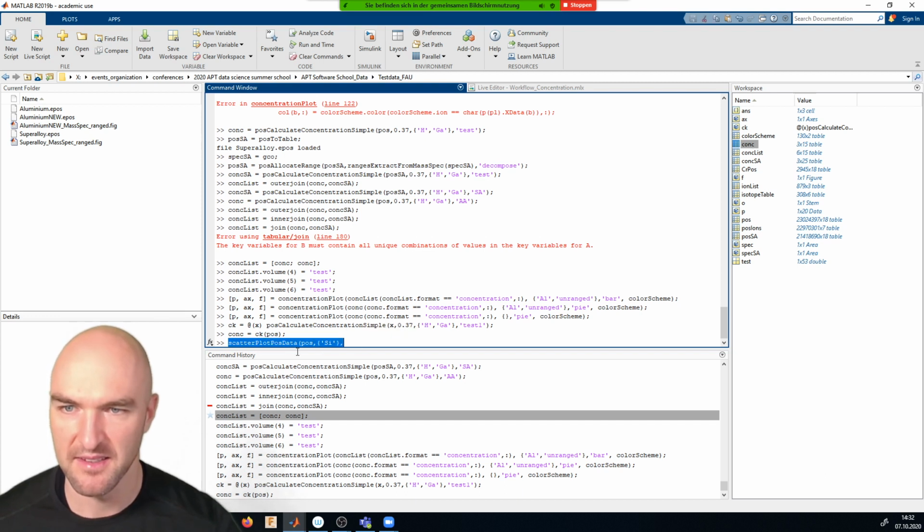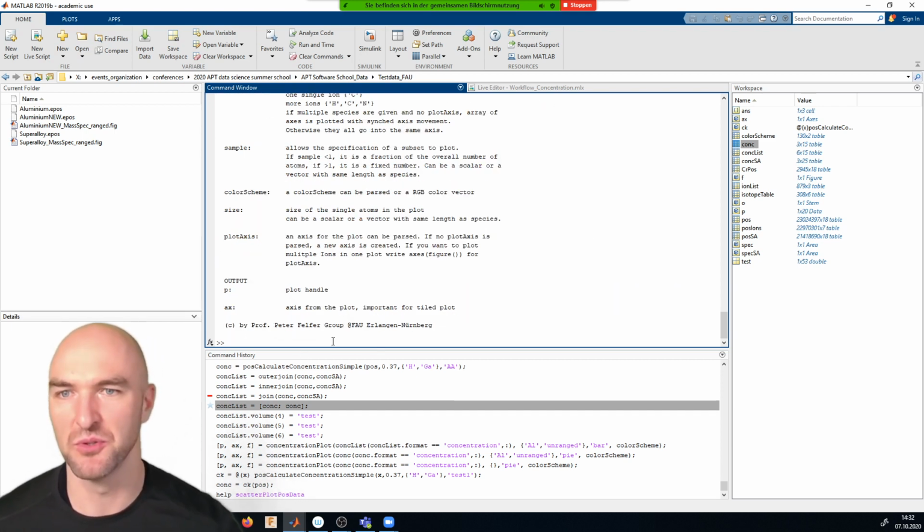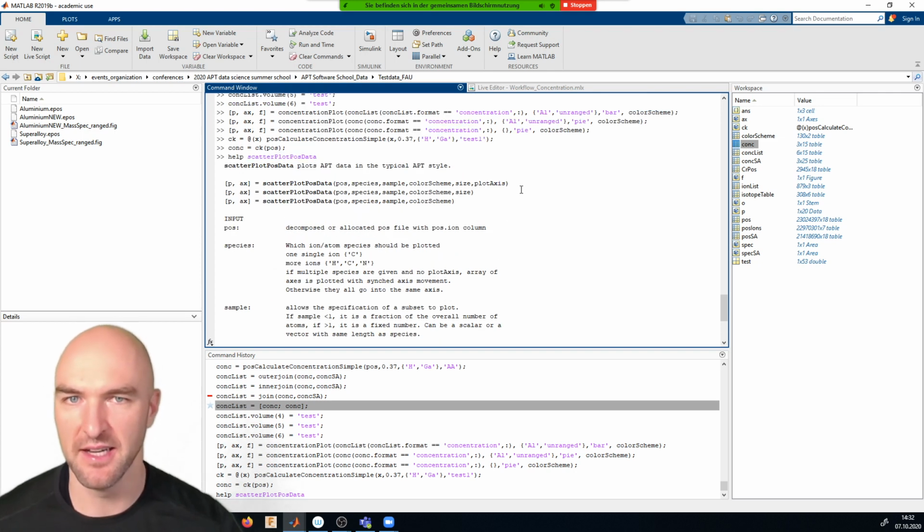And I should probably go with the help for that first, so that I can just copy and paste. It's always the easiest thing to do. So you can see here, we will start with the simplest version of the plot function, or maybe we'll include the size already, the plot size.